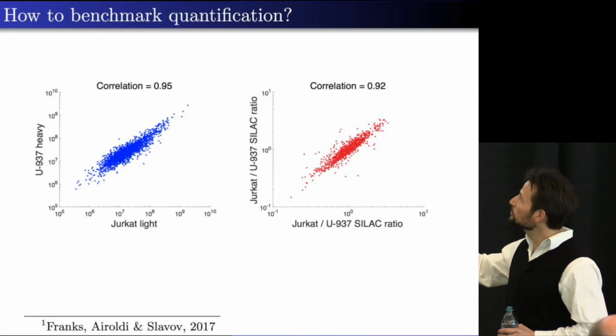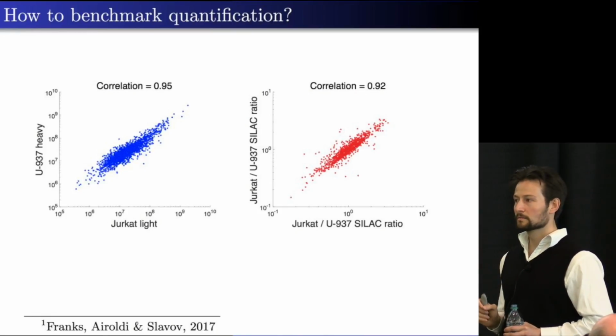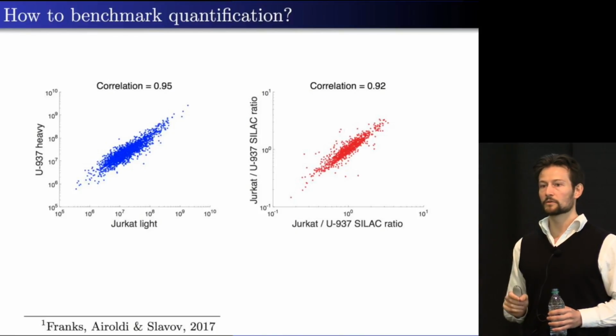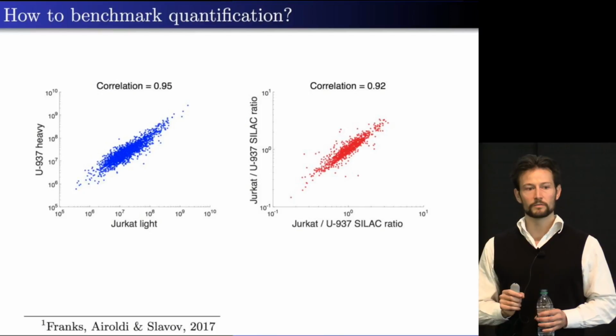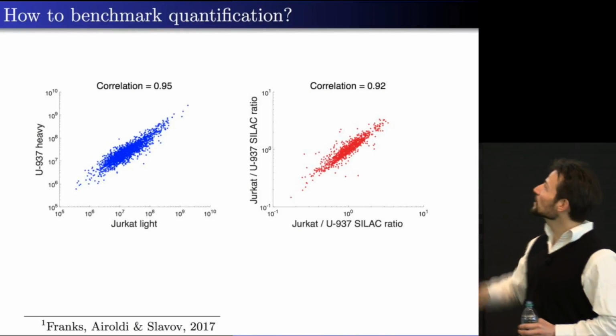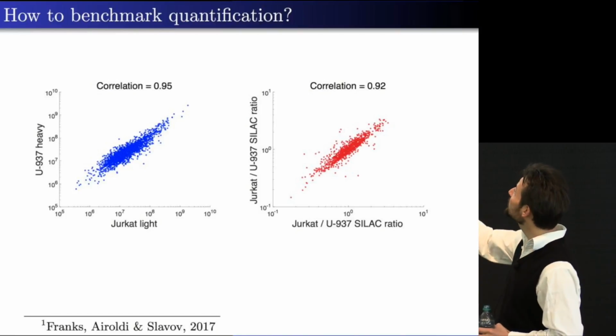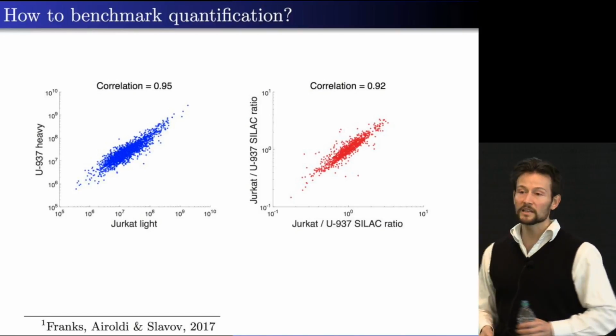And this type of plot is just no good for being able to evaluate whether there are differences in the relative levels between the proteins and the peptides shown here. Because 2-fold difference you cannot see here. You actually can barely see tenfold difference because they're, what, 4 or 5 orders of magnitude.